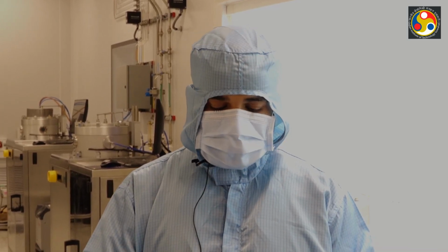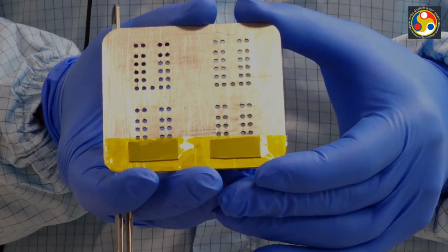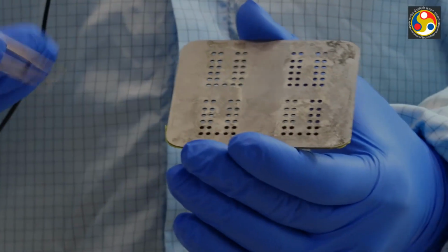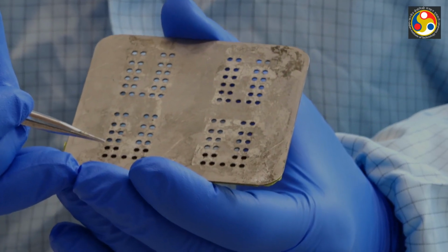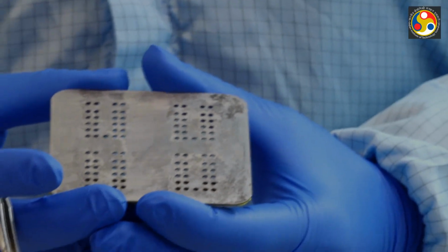We have placed this on this metal grid. You can see the samples, and we put the Kapton tape to immobilize it over the metal grid. So in these circles the silicon dioxide deposition will be performed. Now I am going to demonstrate PECVD equipment and PECVD process.